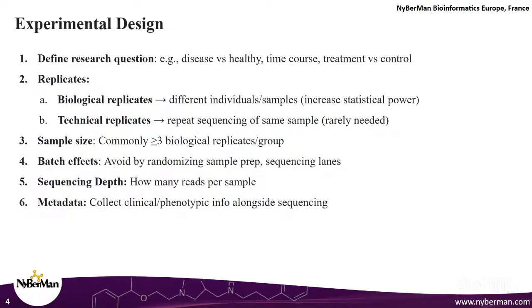etc. So these are all metadata, and they are what will help you correlate your RNA-seq analysis results with the actual phenotype, and give you greater confidence that whatever you have analyzed on the molecular level actually shows some kind of trait or phenotypic effect, right? And that is why collecting metadata is also so important.